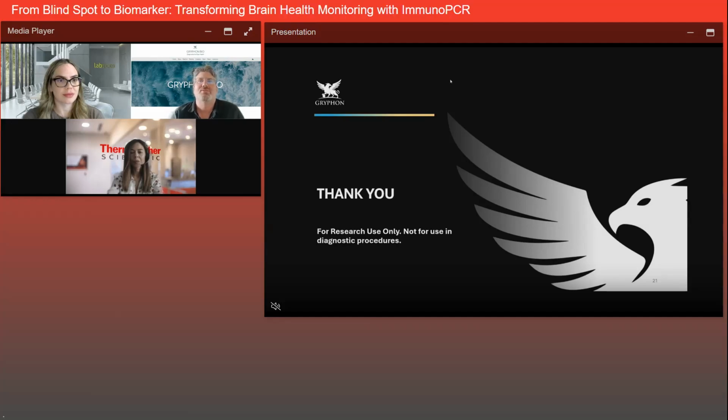But then when we move into blood, that's plasma or serum or capillary blood, then we will essentially just move forward with ImmunoPCR methods that are better at digging deeper into a wide dynamic range of proteins, where you could have some masking by albumin or the high abundance proteins of the lower abundance proteins. And sometimes that means that we need to develop our own antibody reagents to do these ImmunoPCR measurements of some post-translationally modified proteins that we found by mass spectrometry. So there's a nice back and forth between the two technologies.